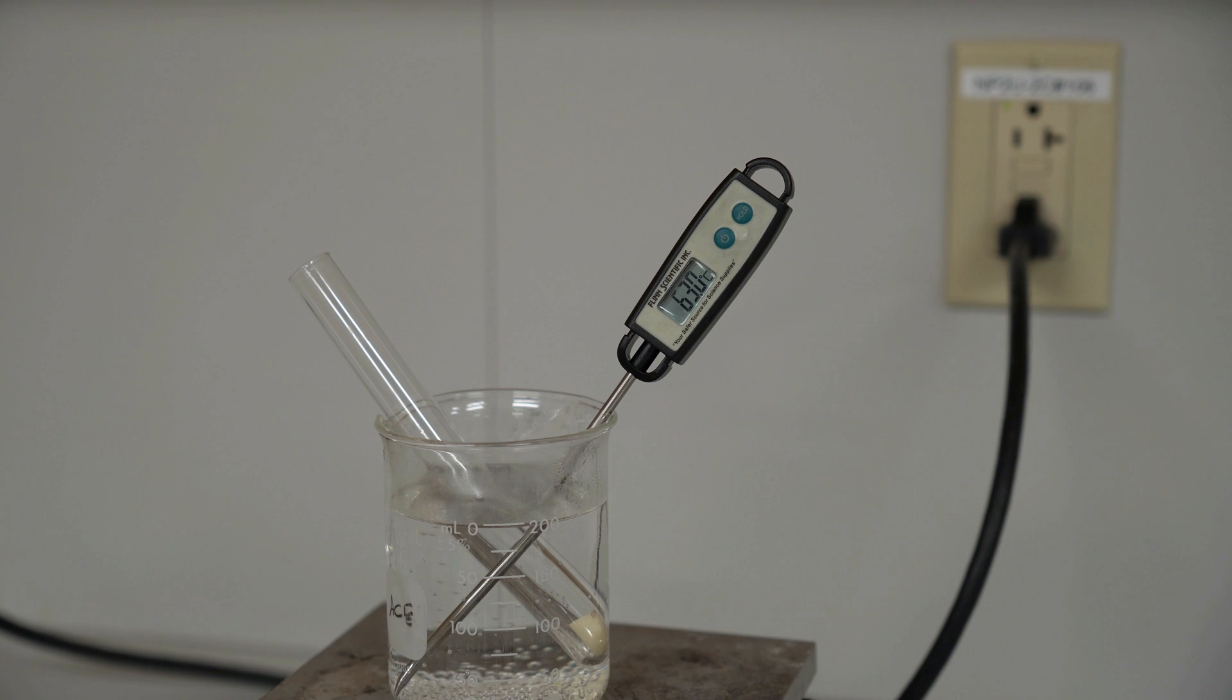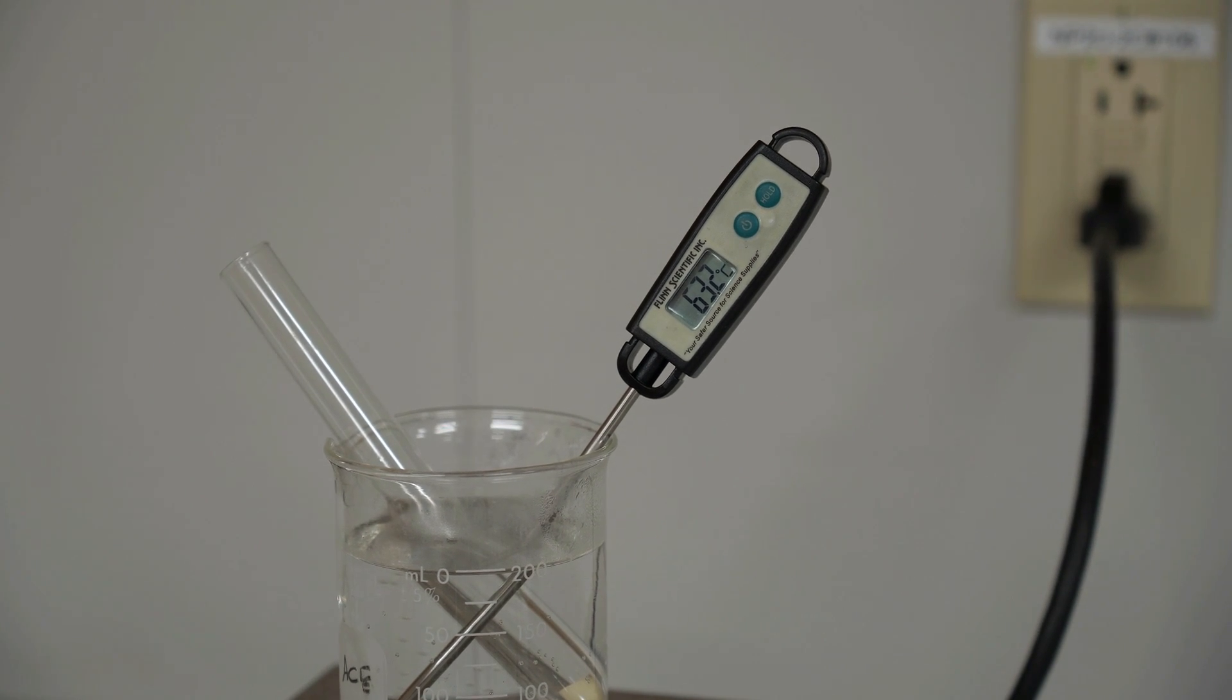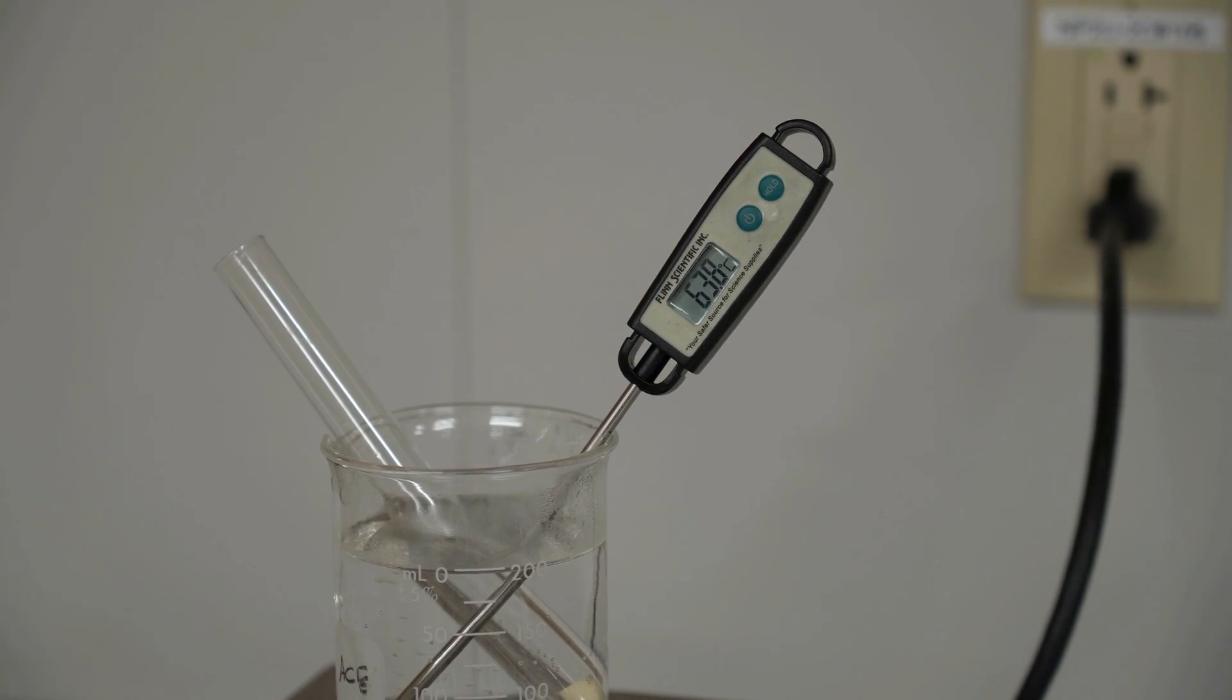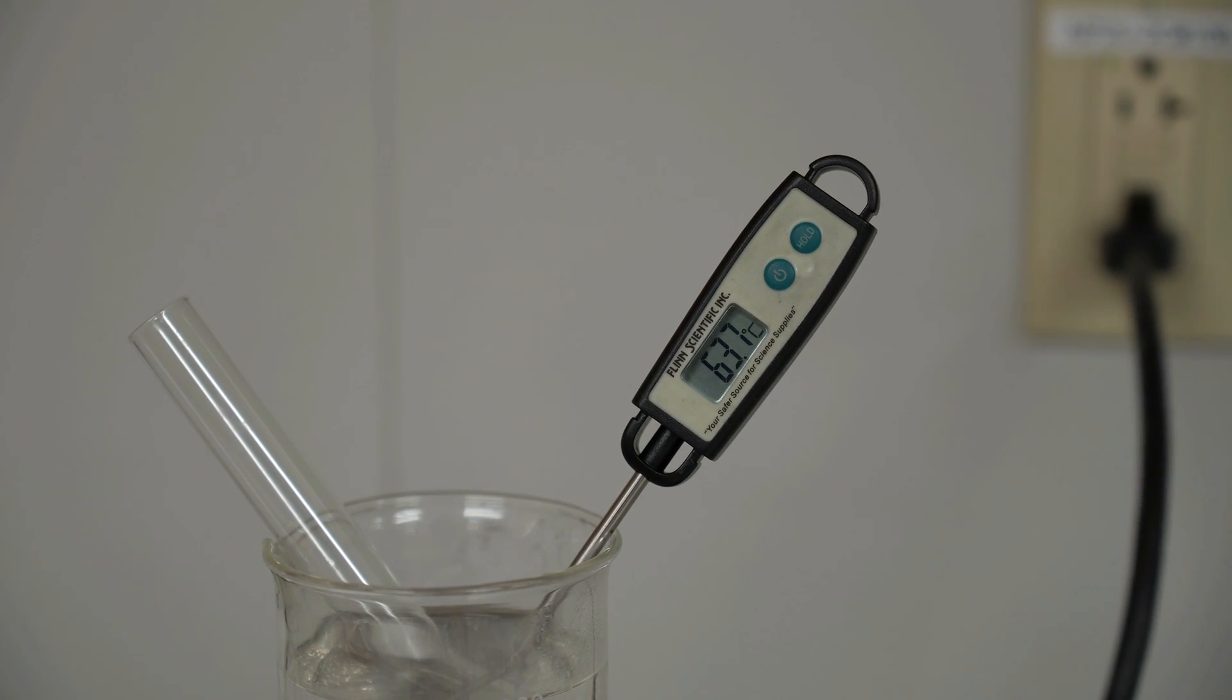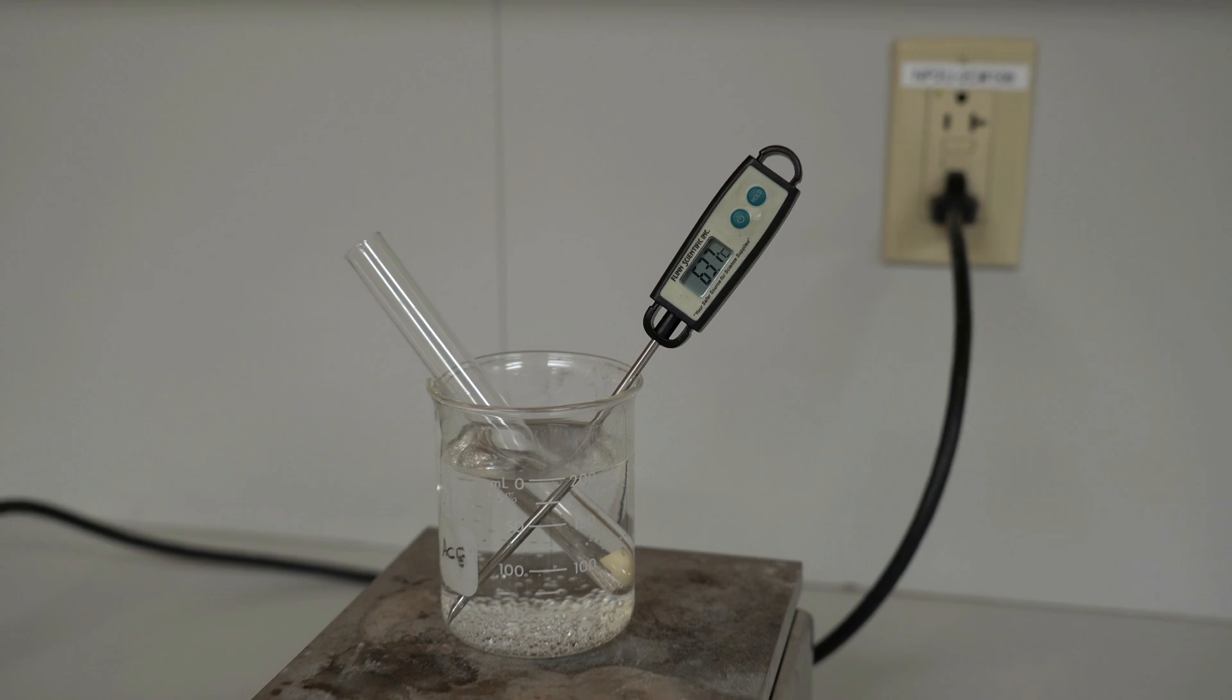We're going to let this sit for approximately five minutes or so, just to ensure the potato chunk is fully exposed to that temperature. Just under 64, at 63.7 degrees Celsius is where it has settled out. This is our warm water bath.